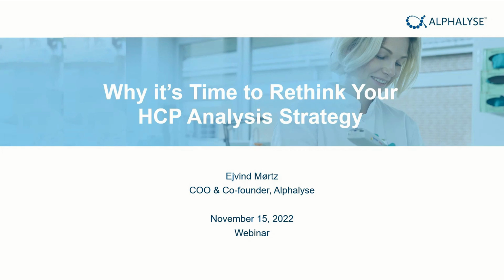We have analyzed many projects, and we often get the question from clients if we could not use LCMS for release testing rather than ELISA. And these are typical in projects where there is no good ELISA available, or where you have a fast track development of your project. Could be a COVID-19 vaccine, for example.